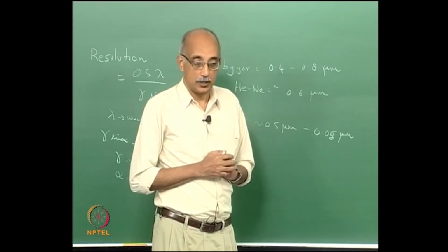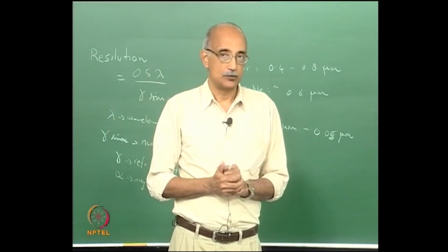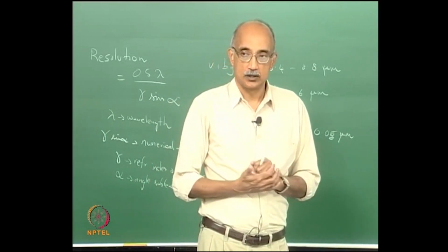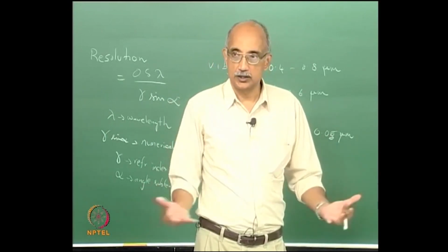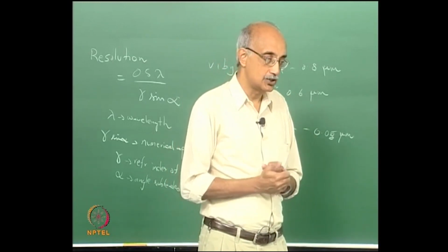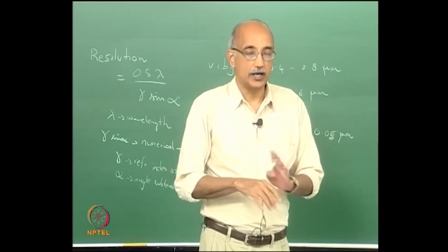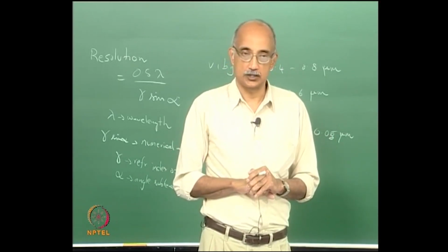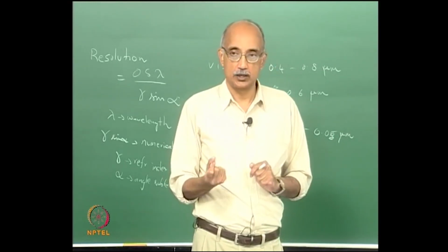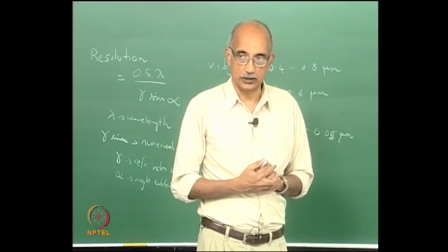On the other hand, if I were really trying to characterize particle distribution on this surface, I would not try to do it in a scanning mode, because I will just get too much noise compared to the signal, the noise being the reflection and scattering that you get from the surface itself. Instead, I will try to grab as refined a picture or image of the surface as possible, and then depend on my processing software to eliminate the noise and give me as clean a signal as possible.